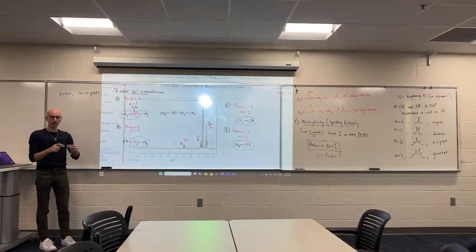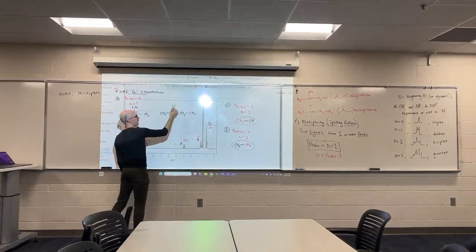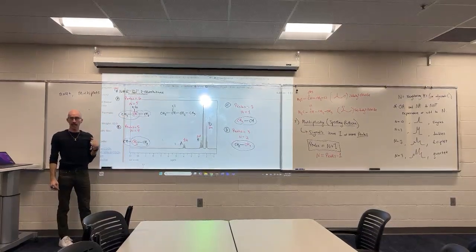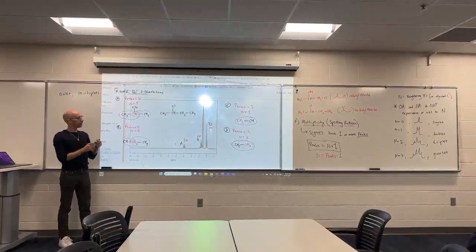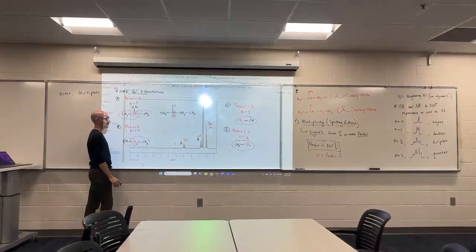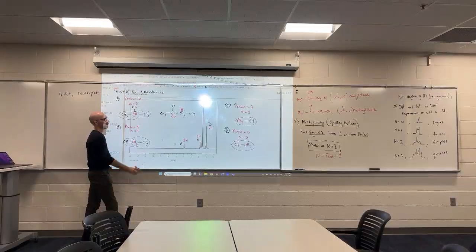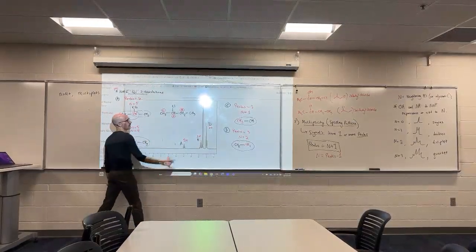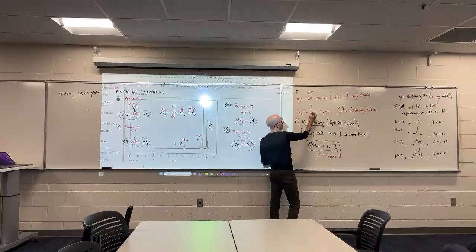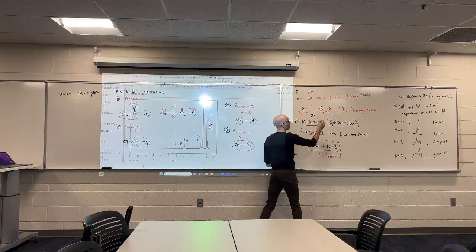And then from the chemical formula, the only other thing that I was missing was my chlorine, the explanation of why the 1H signal is the furthest left signal. And here's what I'm going to do. This belongs to A. This belongs to B. This belongs to C. And this belongs to D. Or if you want to see it here, A, B, C, D.